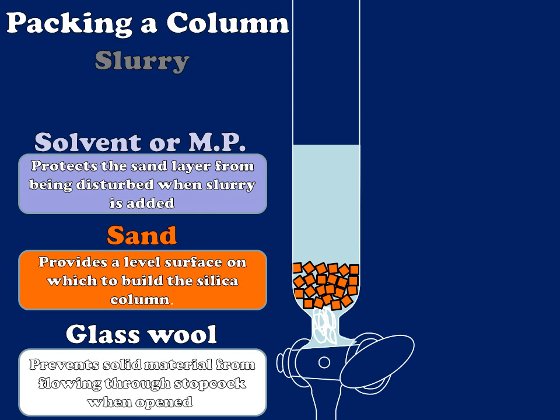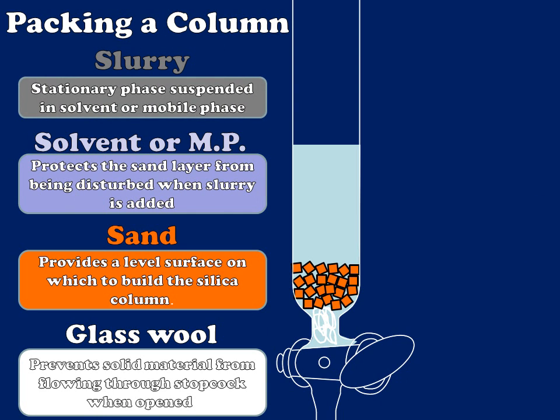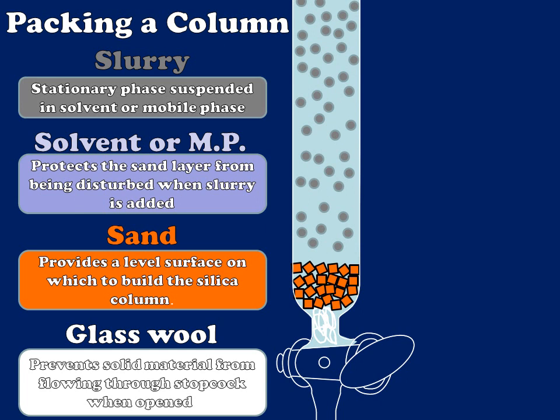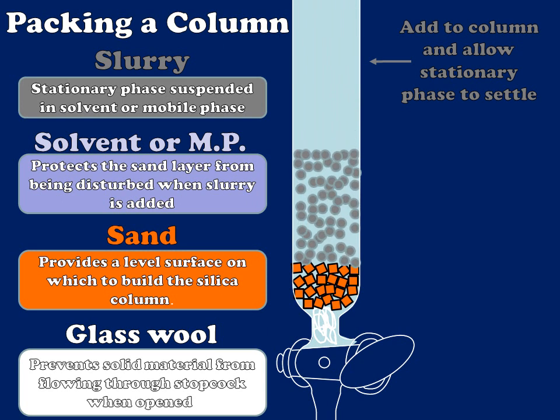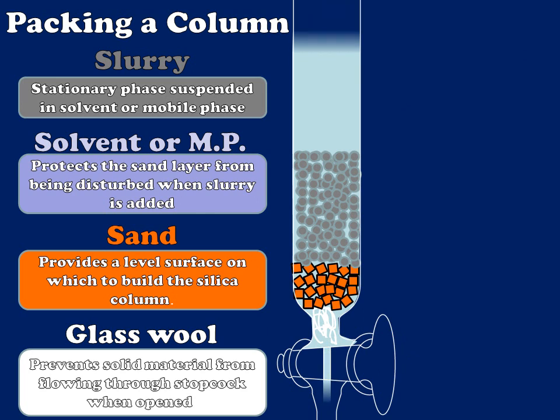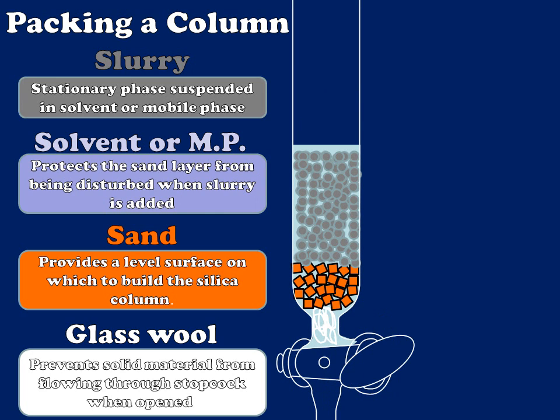I'm going to add my slurry now, which is my stationary phase suspended in my mobile phase or solvent. When I first do this I'll have a suspension which fills the column, but over time density will cause it to settle. If I've done this correctly, it will give me a nice uniform column of regular density, regular width, and regular length. I can then drain the mobile phase to the level of my stationary phase, thereby making my column ready to load.